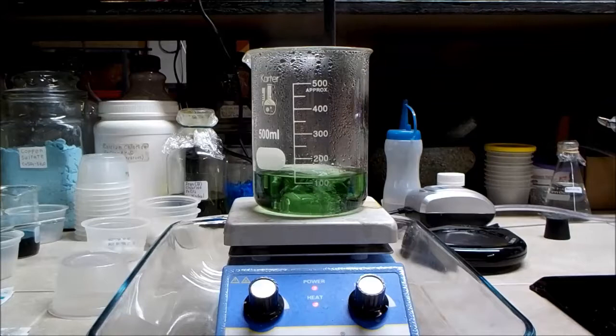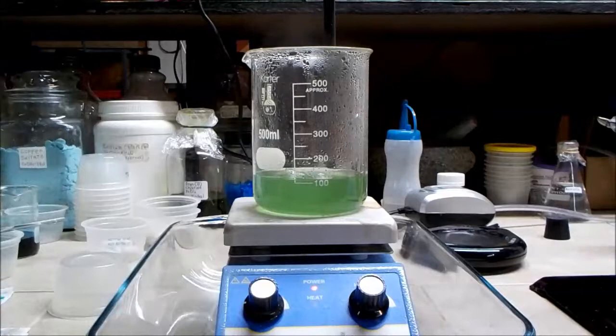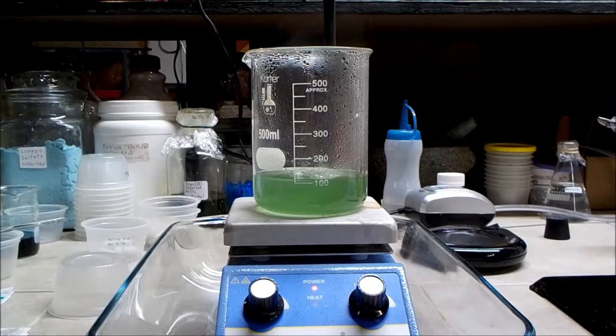Alright, so I'm just over 100 milliliters in volume, and I can see now that crystals are already trying to come out of solution and form, so it's saturated even at boiling. So I'm going to turn the heat off and let it cool down. I'm not so interested in getting nice big crystals right now because I'm going to use this product in the next step of this experiment. So all I want to do is just get it out of solution and into crystalline form.